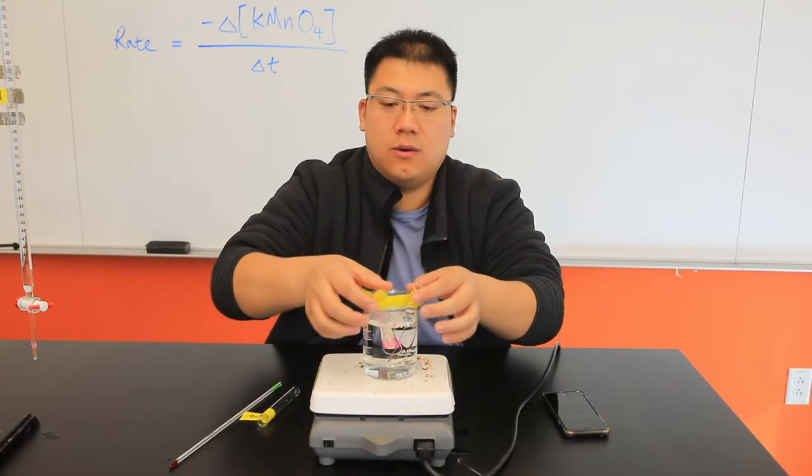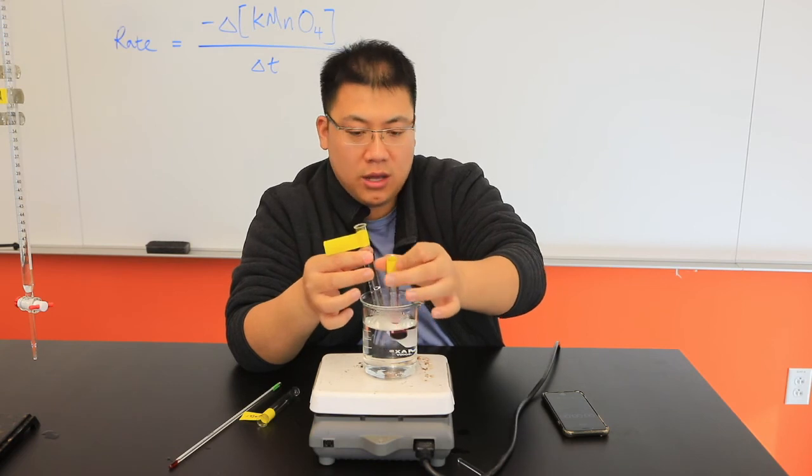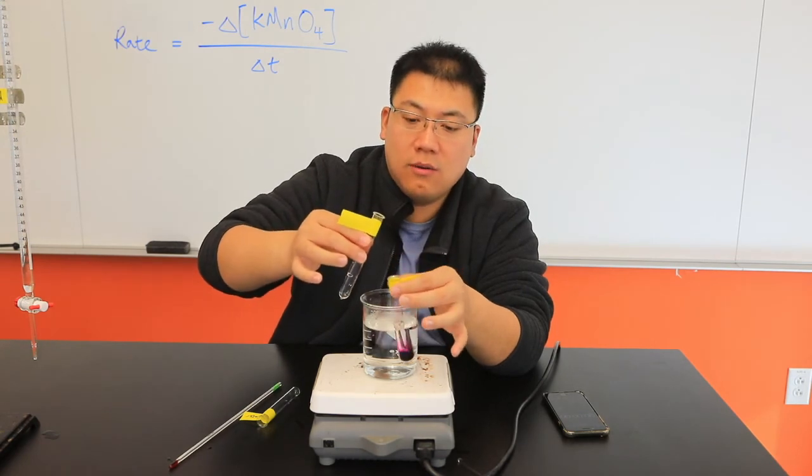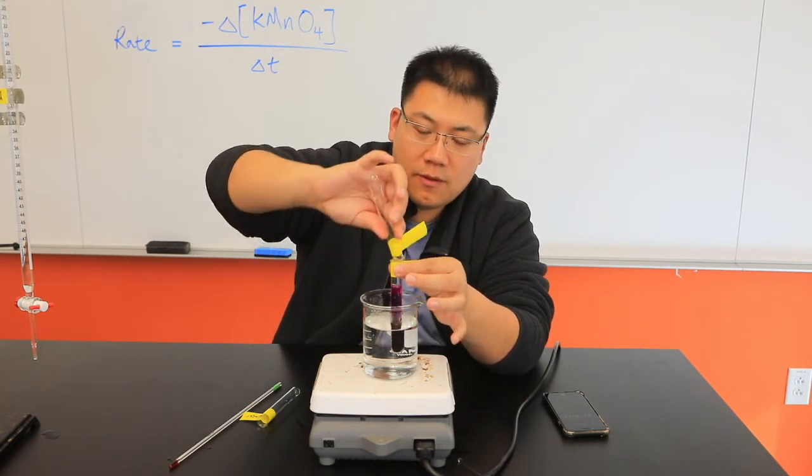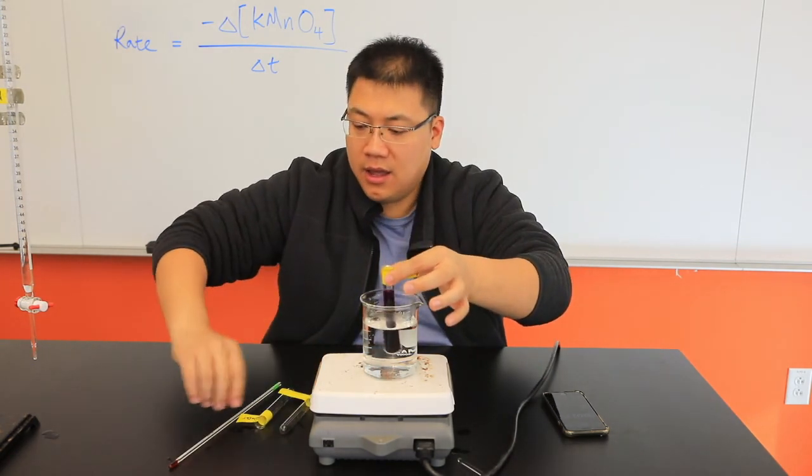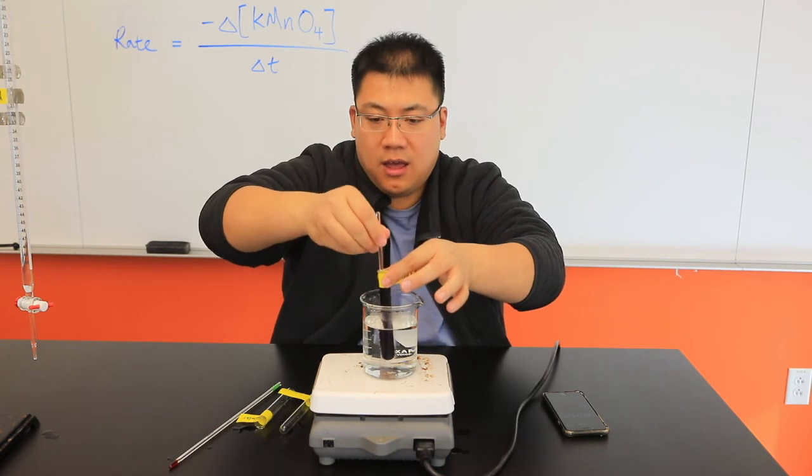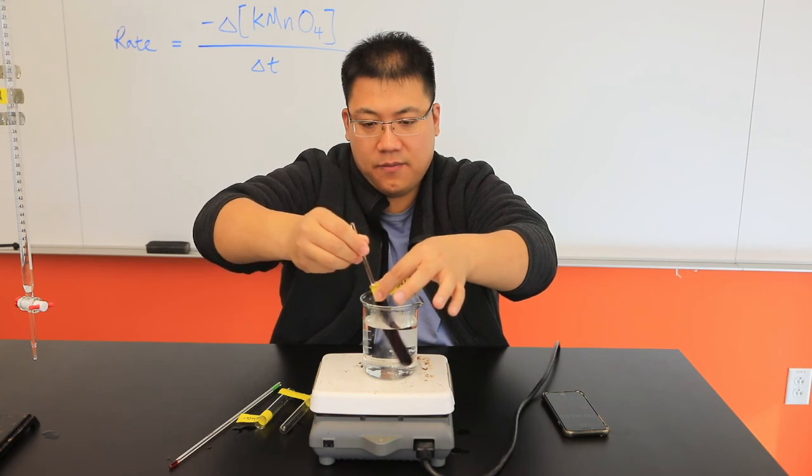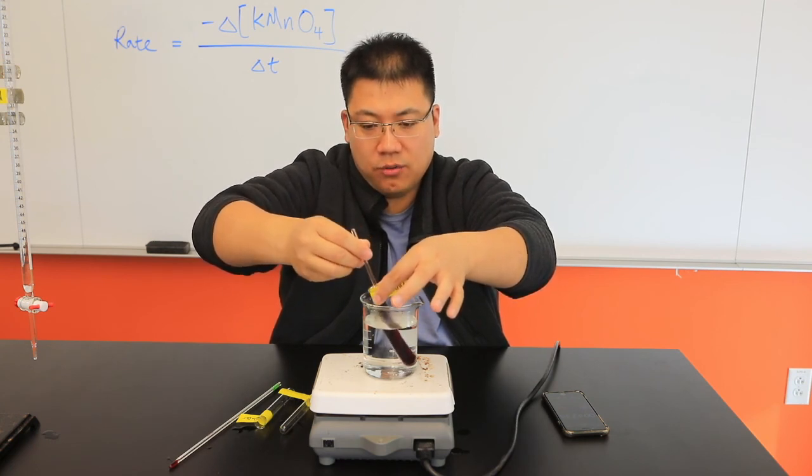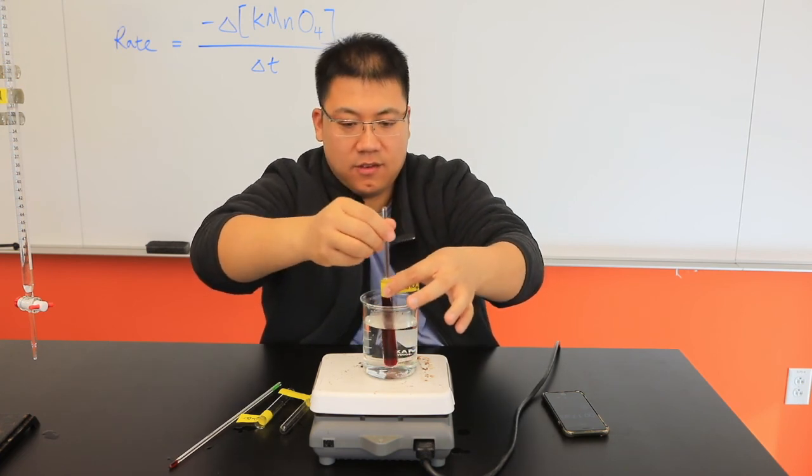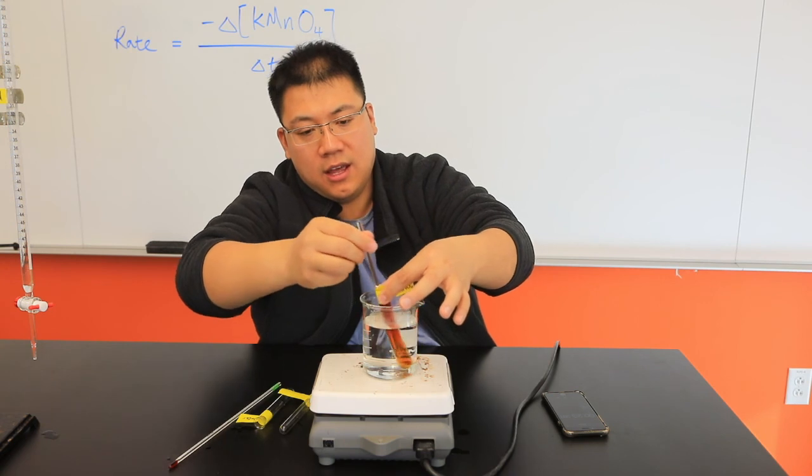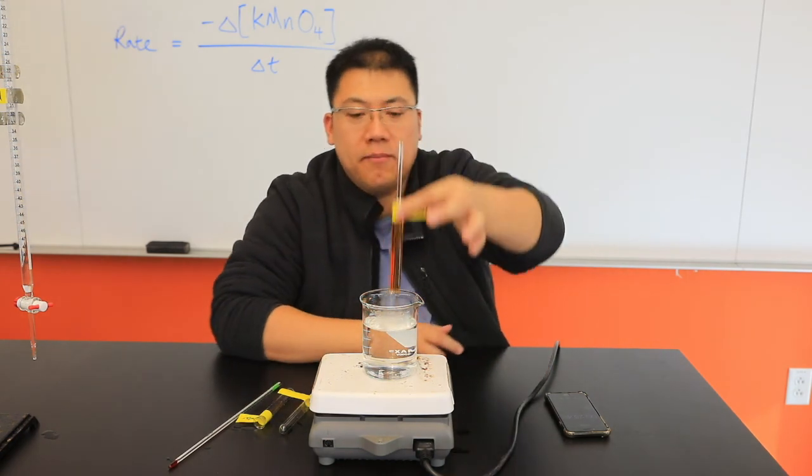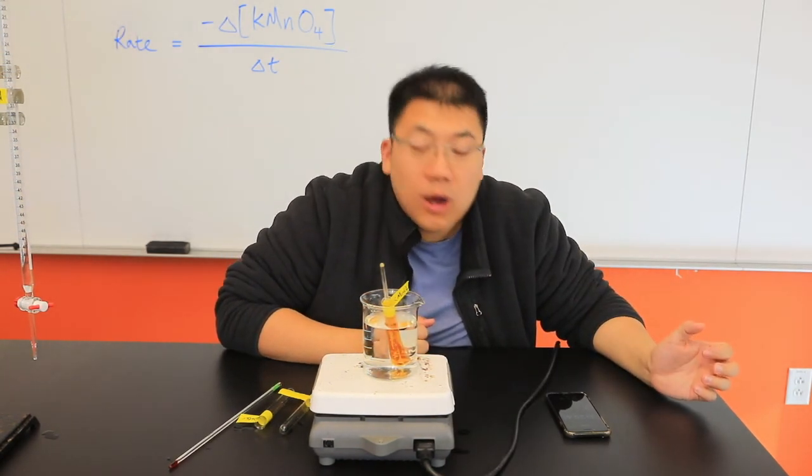So, again, I'm going to pour in the oxalic acid into the potassium permanganate test tube. And then, I will hit start. Quick. I need to make it quick. And then, I should start timing and mixing immediately. My water level really should be a little bit higher in this case. As you can see, this has already changed to red. And then, to yellow. Like this. Done. Stop. So, the time that I have is 25 seconds. It's much faster than at a lower temperature.